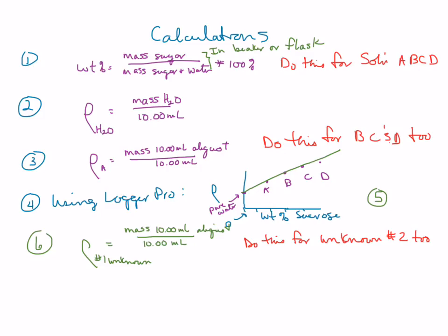I think, let me read the calculations, but usually my calculations say, whenever you have a graph like this, you need to give me a hard copy of the graph, and don't wait till the last minute to do this or ask me if you have questions, but you need to somehow get a printout of that puppy. And whenever there's a graph, you also need to give me the XY coordinates. Okay? So like the Excel document that we do, basically. Yes, but don't use Excel, use Logger Pro.